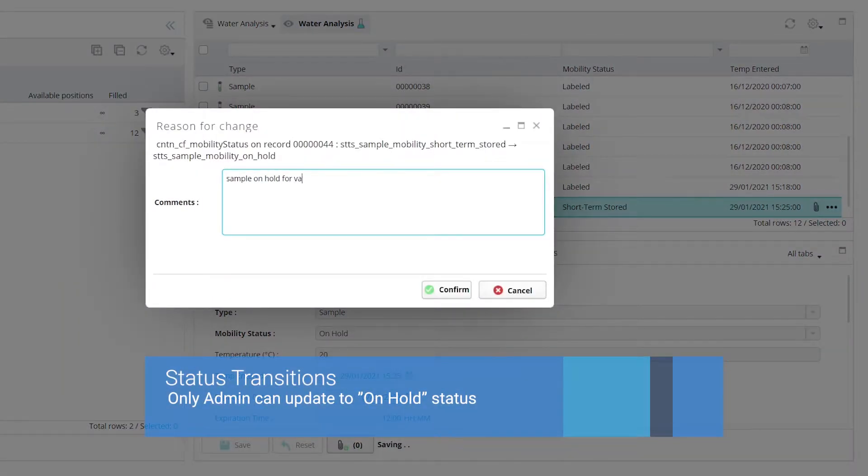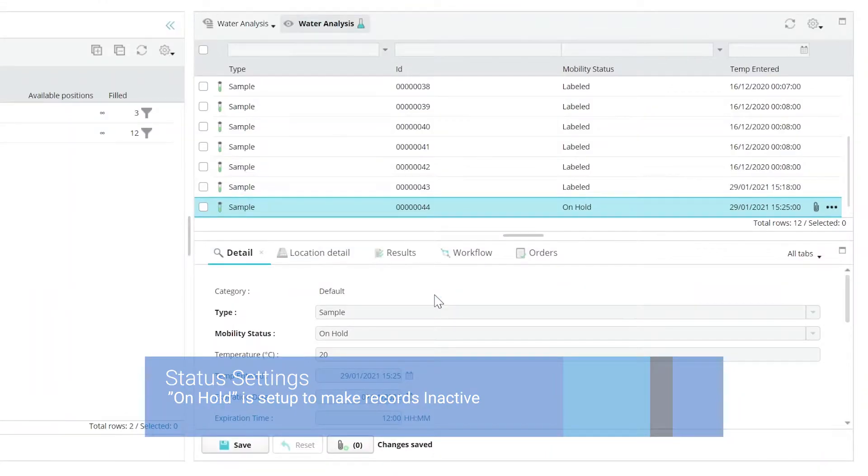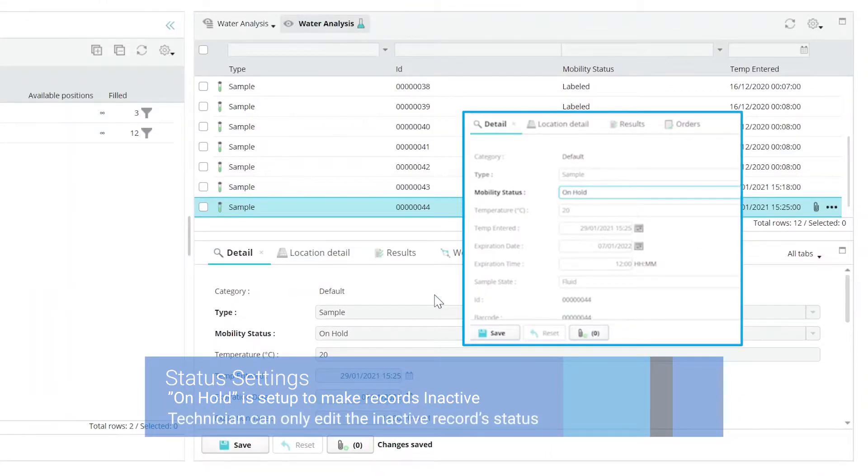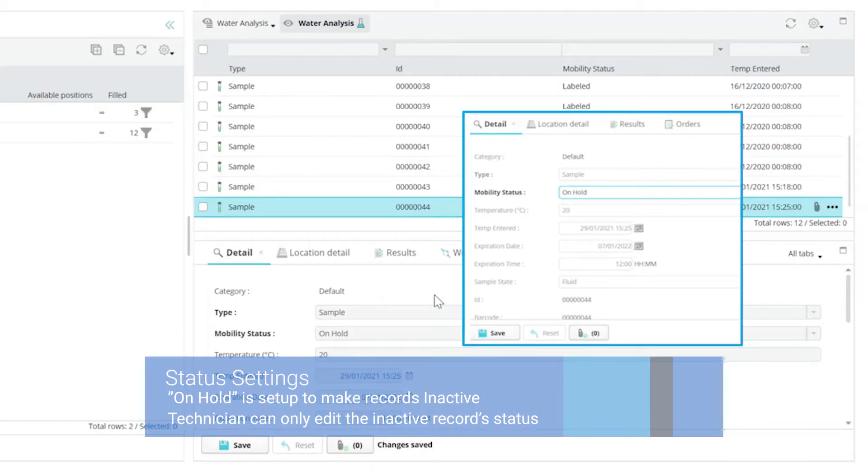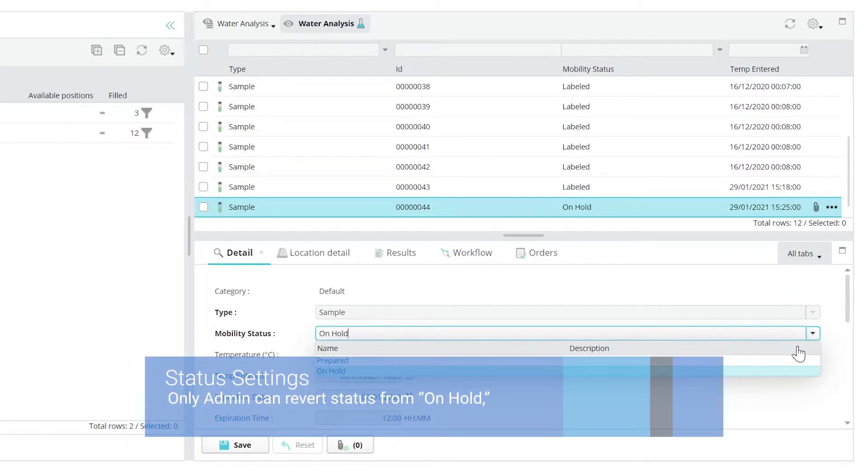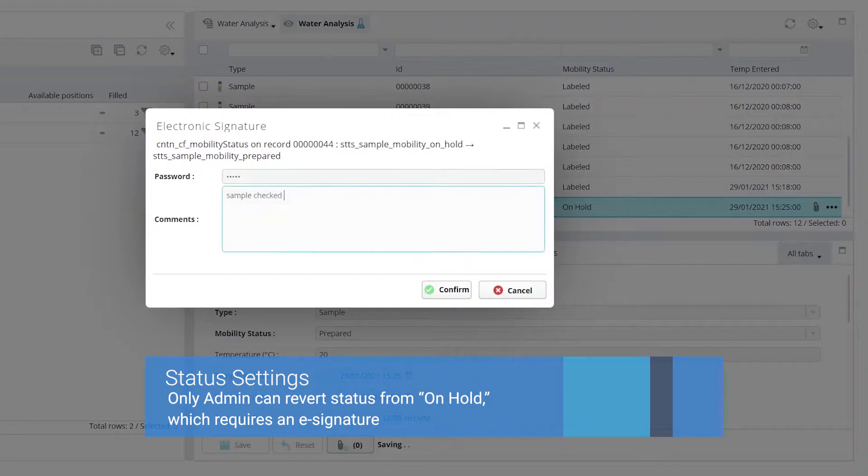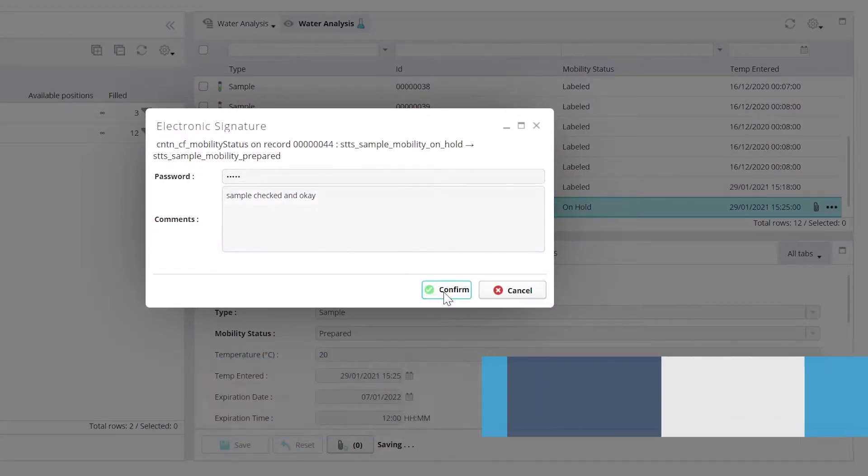Statuses likewise affect whether records in a particular status can be edited or deleted, what user, role, or group can edit or delete them, whether records in a status are active or inactive, and whether the records that use the status workflow are versionable.